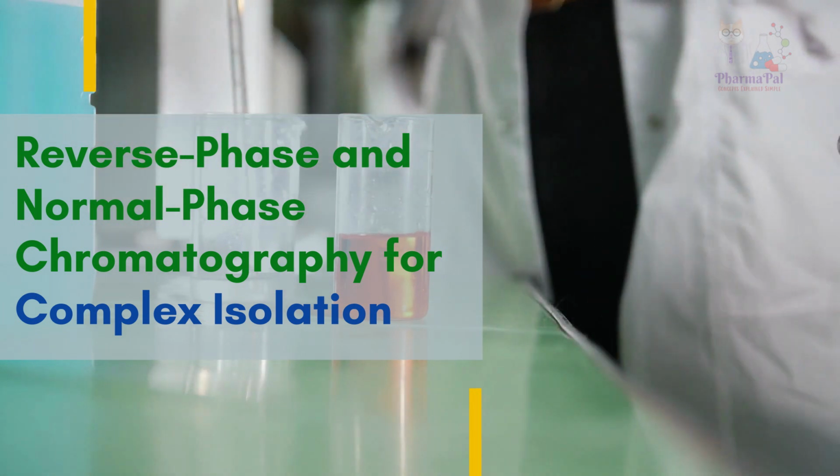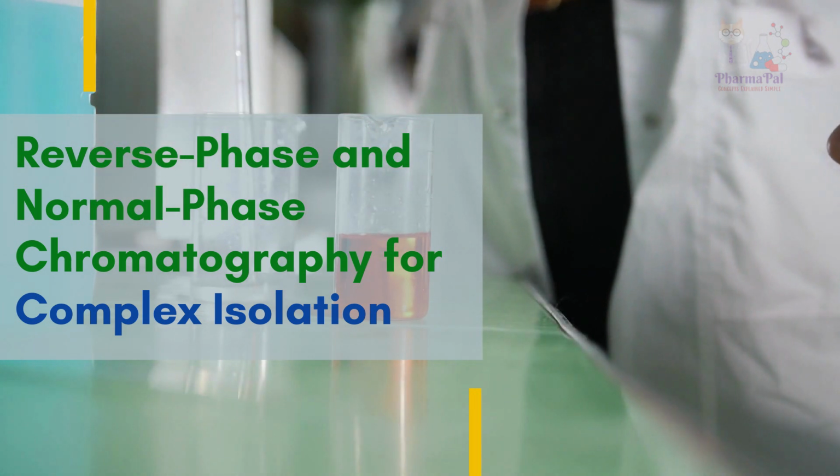Today, we're diving into a fascinating topic: how to isolate and purify caffeine, acetaminophen, and aspirin from a tablet using both reverse phase and normal phase chromatography. Sounds complex? Don't worry, I'll break it down step by step.